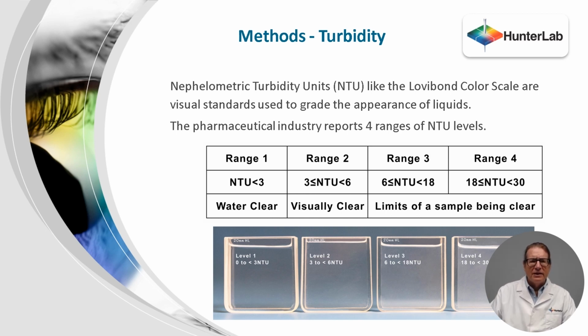Clarity is used to describe the clearness of a sample relative to water. Nephelometric turbidity units, NTU, is a visual standard used to grade the appearance of liquids, just like Lovibond color filters are a visual standard. The pharmaceutical industry and others employ 4 ranges of NTU levels when describing clarity.